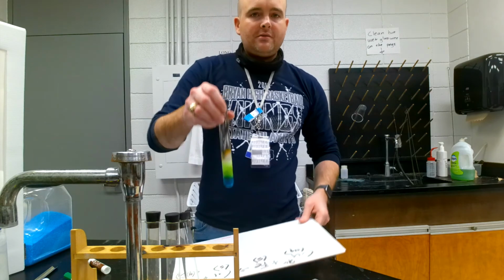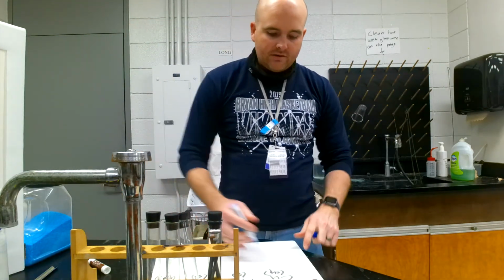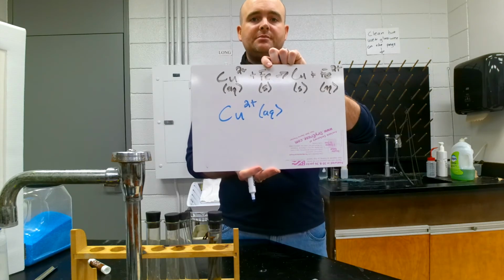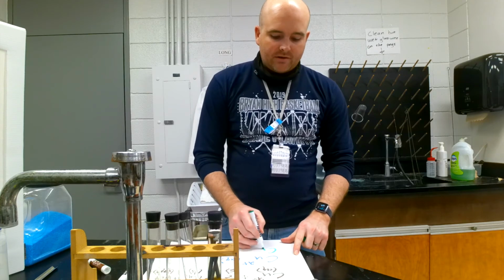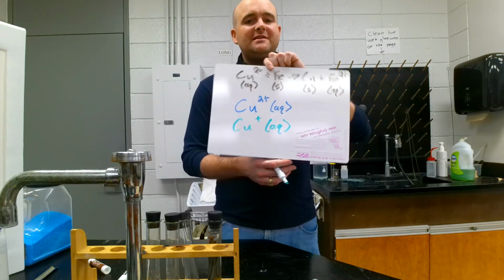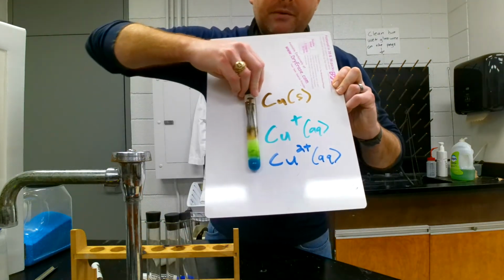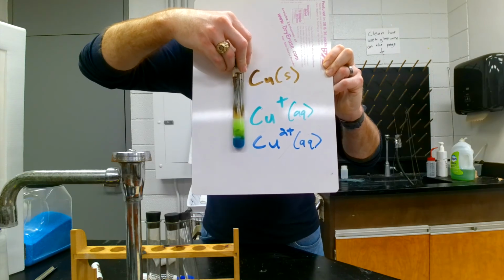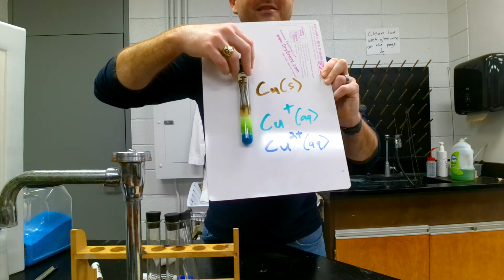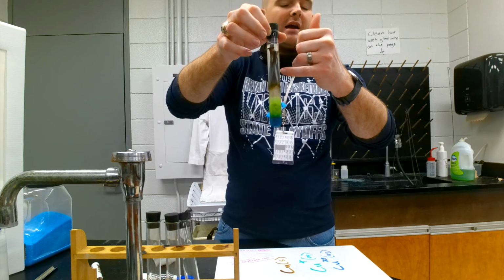Now, an interesting thing to note down here is you see that blue and that green? Well, copper in the 2 plus state, it's aqueous, is blue. Copper 2 plus is blue. But copper that is 1 plus is green. Very cool. So you can see something cool here where you have the copper 2 plus at the bottom, and you can see the progression in the copper plus, and you can see the progression in the copper 0. And it looks really cool. I think that's a really neat trick that they added there. And you can see how copper was being reduced going up, and then iron is being oxidized going down.